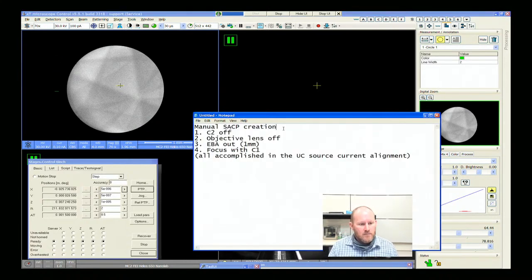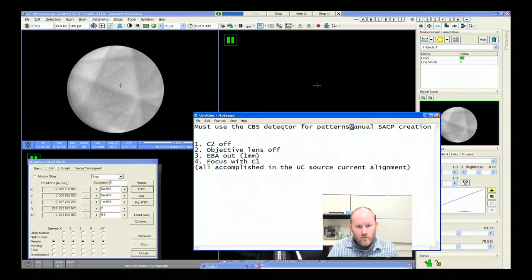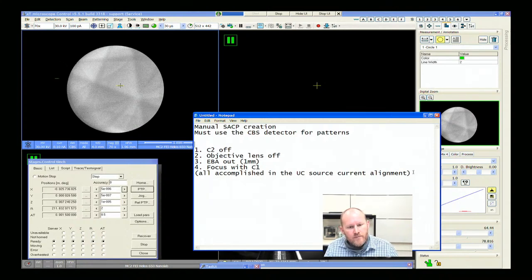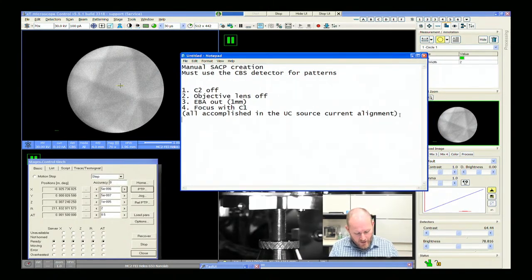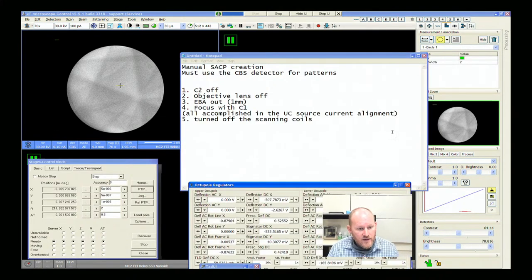Let's go back to our notepad. Must use the CBS detector for patterns. So we turned our C2 off, we turned the objective lens off, with the electron beam aperture out. We then focused with C1. And after focusing with C1, we effectively turned off the scanning coils — which was done in the octopole regulators by turning the deflection AC to zero in the upper and lower octopoles.